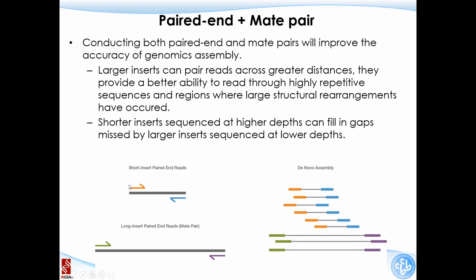This is short read sequencing, where we sequence this end and this end. But for de novo assembly, we normally don't do that anymore. What can be done, if you really care about de novo assembly, is use the mate pair protocol to sequence a small percentage, at low coverage, and then use the traditional protocol to sequence much deeper. Now you have the sequence accuracy taken care of, and at the same time you have the larger structural variability.